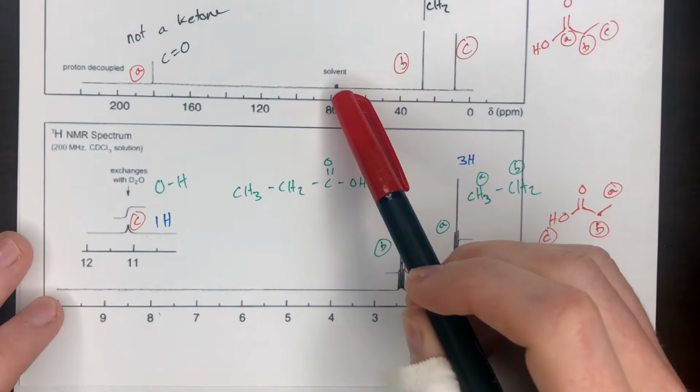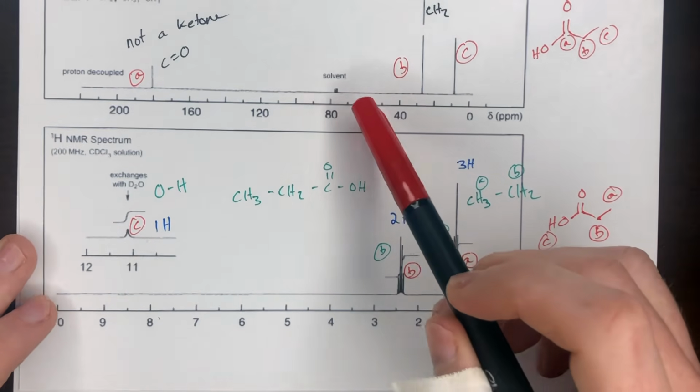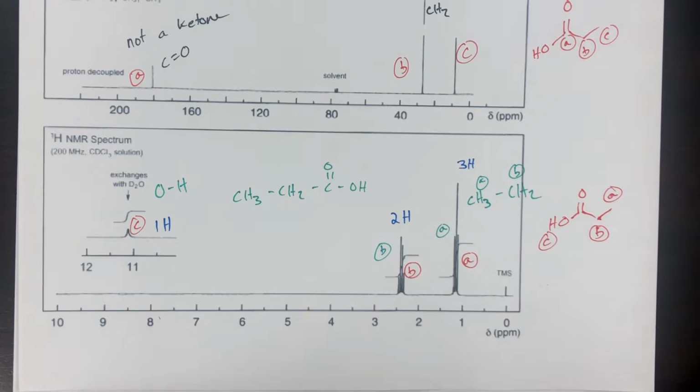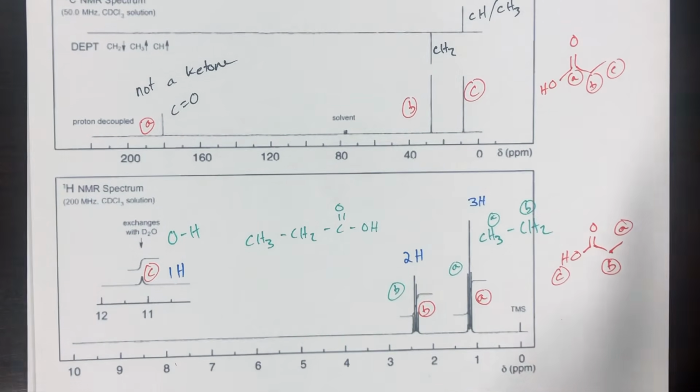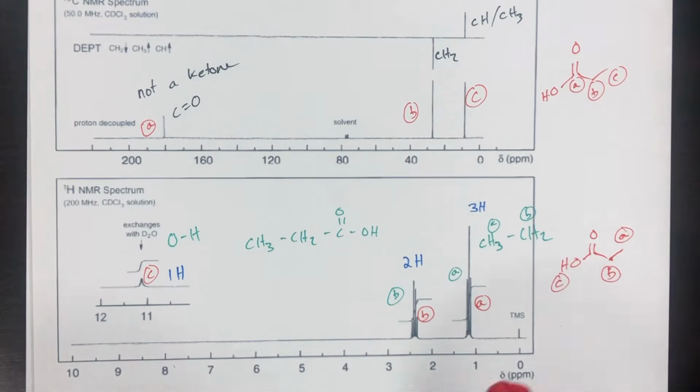And then again, the solvent here is not specified in the case of C-13 NMR, but again, it's just a solvent peak. It's not relevant to the interpretation of the structure.